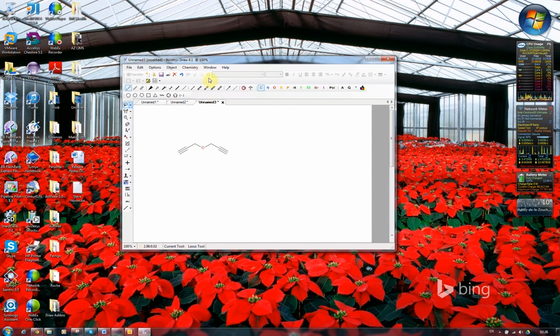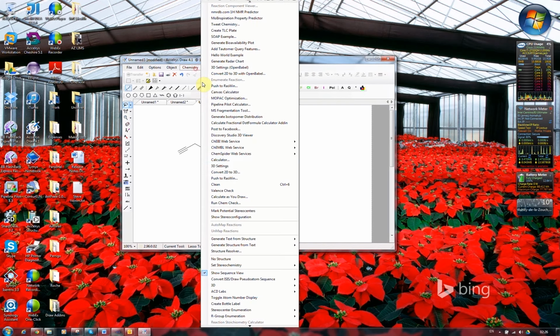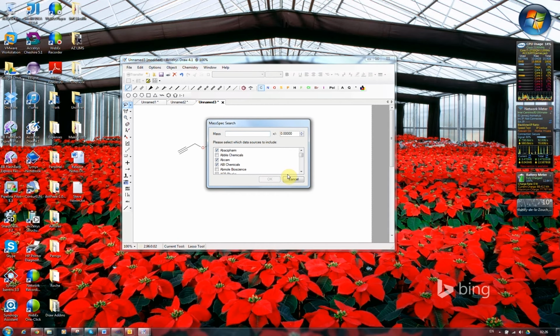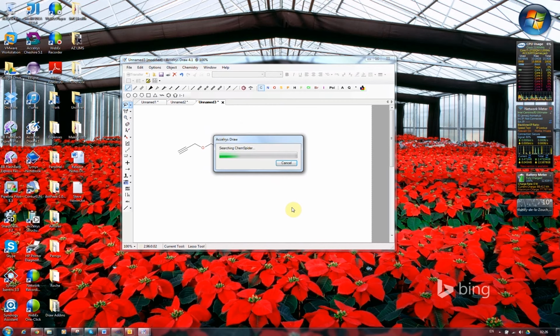So let's go and take a look at the alternative mass spec search, which is by mass. The UI is similar, but just slightly different. In this one, we can specify a target mass and then a range about which we want that to vary. So I'm going to put a 1 in there because I want to get some hits. And then I can just go ahead and click OK. Start the search off again.